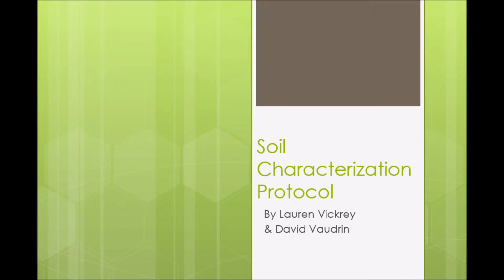The title of our experiment is the Soil Characterization Protocol by Lauren Vickrey and David Vaudrin.